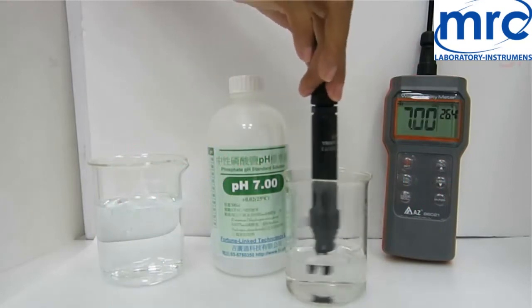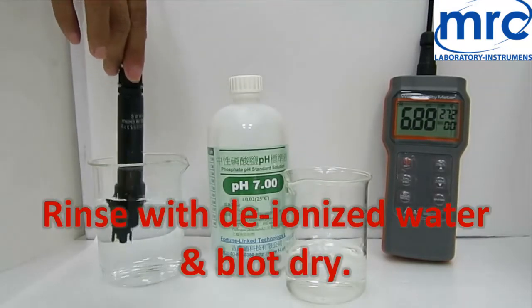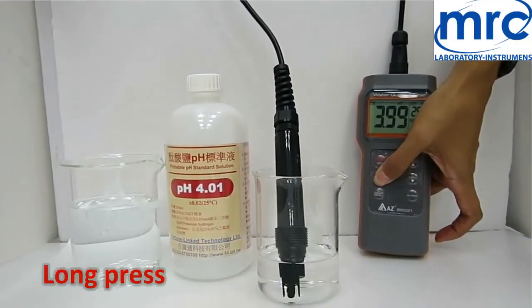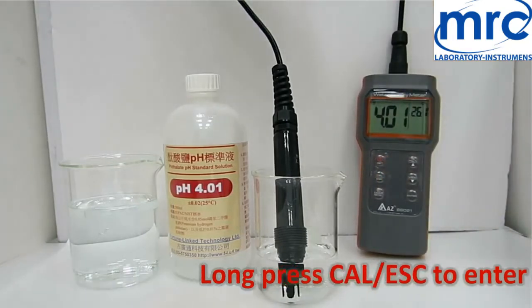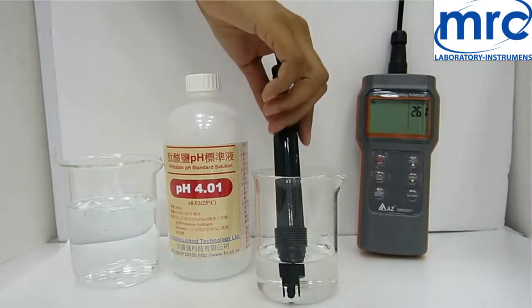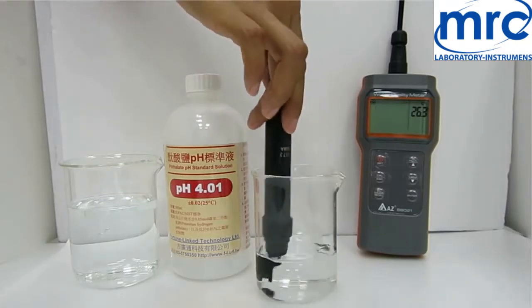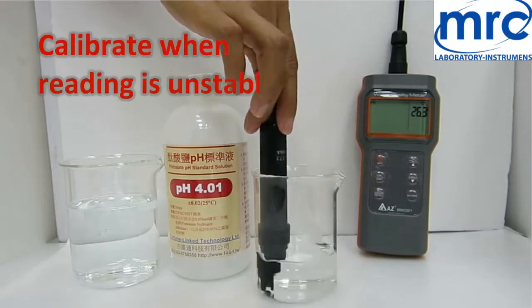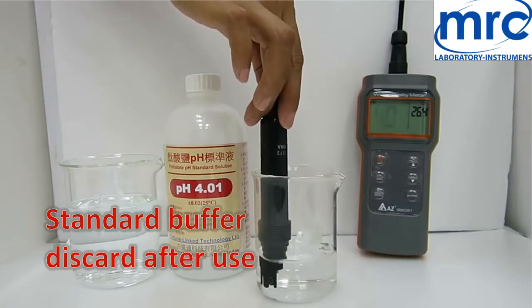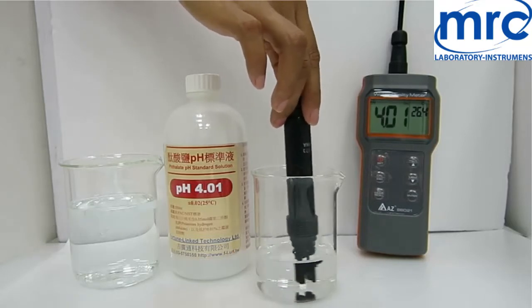Rinse the probe with deionized water and blot dry. For pH 4: long press Cal to enter calibration. Set the standard value using the up and down keys. Use a transparent container and make sure the pH electrode is completely immersed in buffer. Stir gently to get a homogeneous condition. Do not reuse standard buffer. Once the reading stabilizes, press Enter or wait for the SA icon to appear.